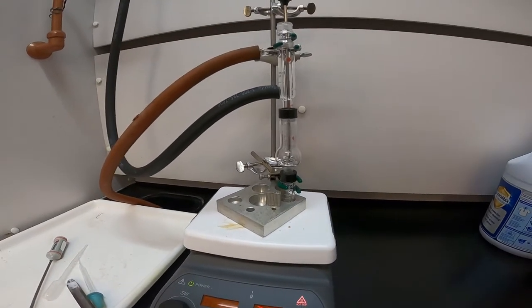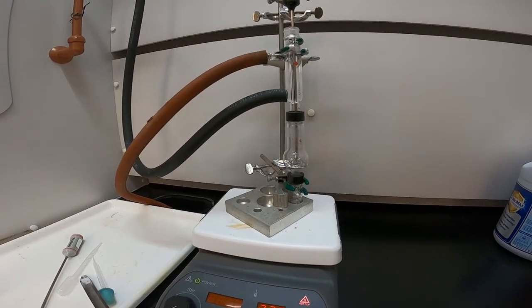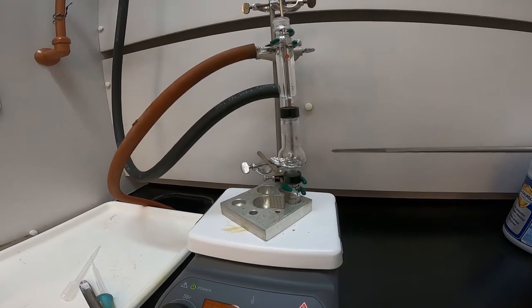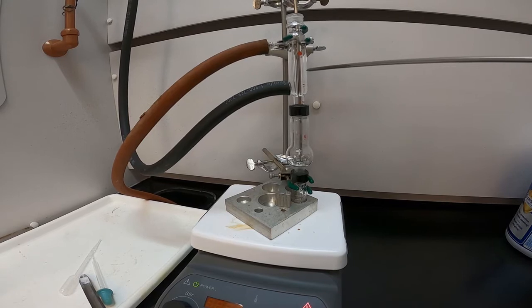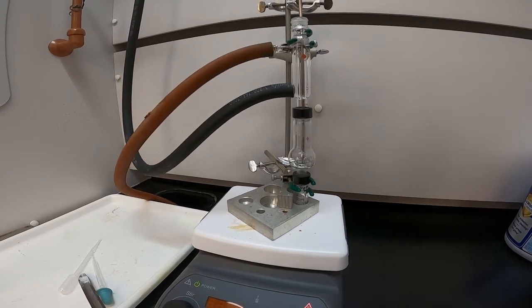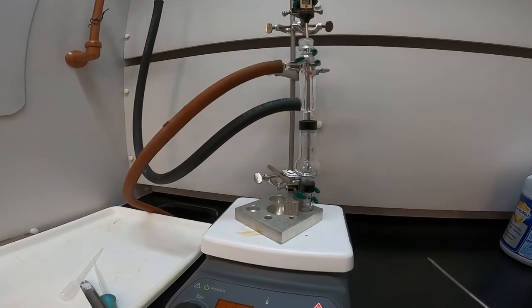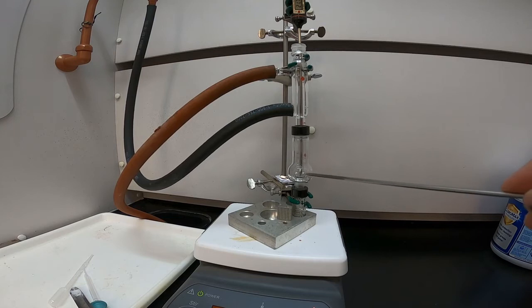And then what I also have set up in the apparatus, I have what's called a Hickman distillation head, which is this part in the middle. And then I have the reflux condenser again running with water. And then on top I have a thermometer that, if you look carefully, the thermometer tip is right down here above the collection neck of the Hickman distillation apparatus.